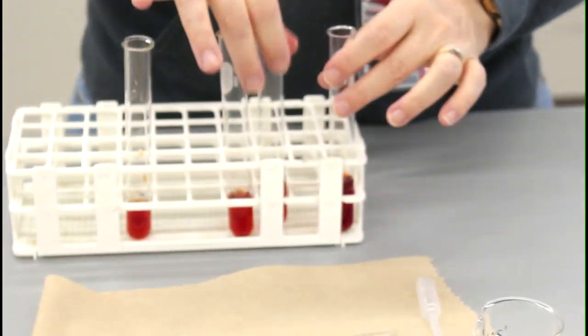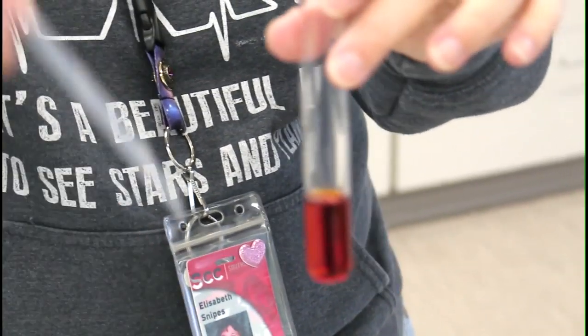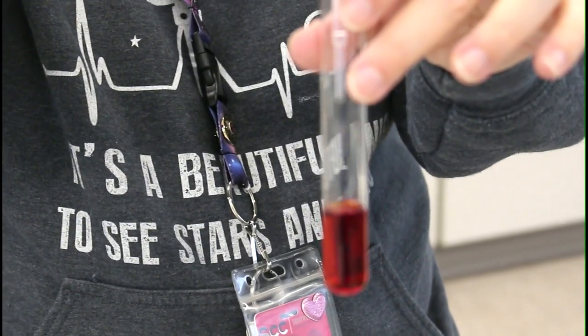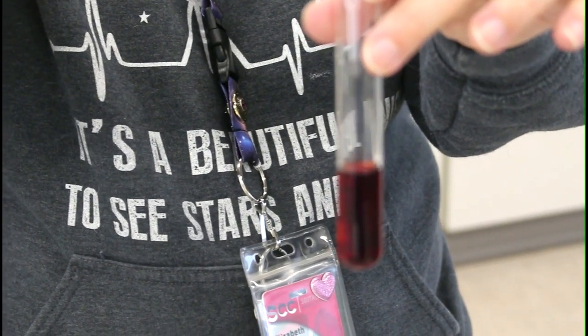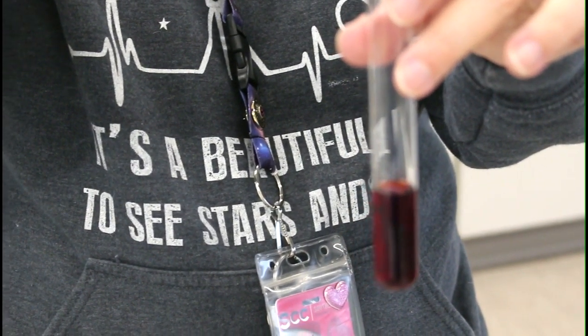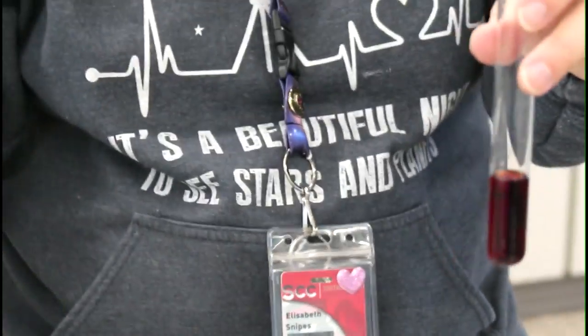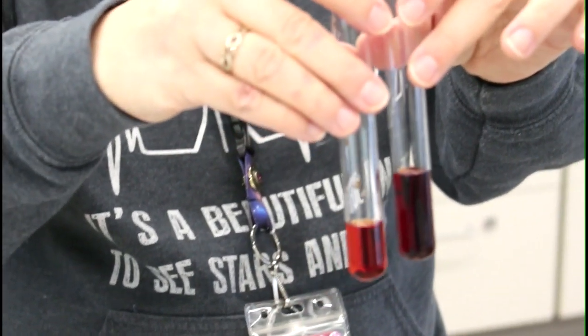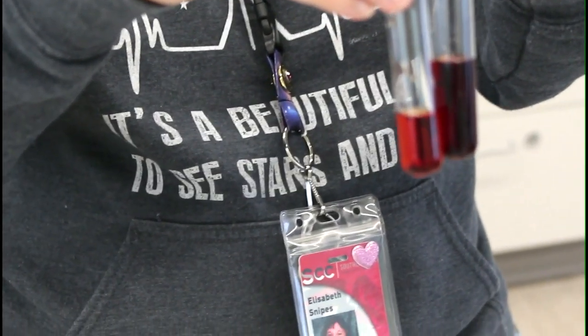Okay, I'm going to stress the second one by adding the other reactant, which is the thiocyanate. 1 ml. Let's see what we got. Ooh, okay. Adding a reactant will favor the equilibrium to... Oh my goodness, it looks even darker red. Let's compare it to the control. All right, I hope somebody can explain to us why. Please, we're looking forward to that.